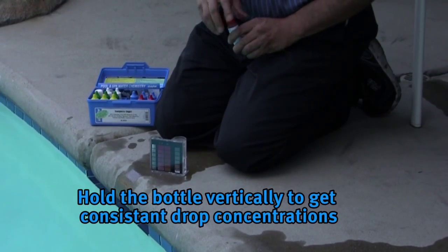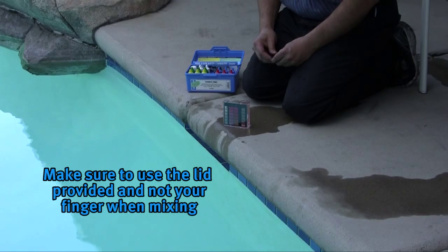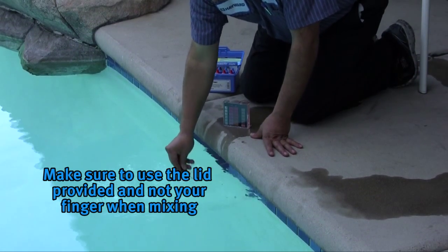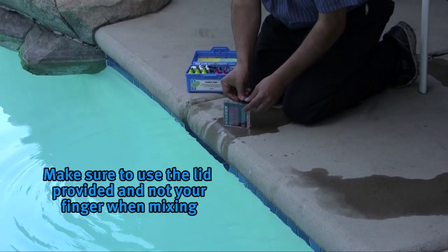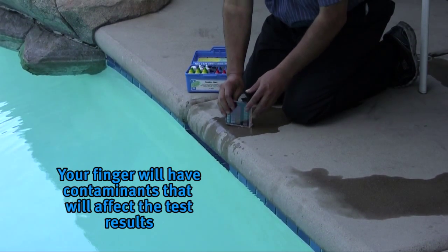When adding the drops to the test chamber it is a good idea to hold the bottle vertical to get consistent drop concentrations. Make sure to use the lid provided and not your finger when mixing the water with the test solution. Your finger will have contaminants that will affect the test results.